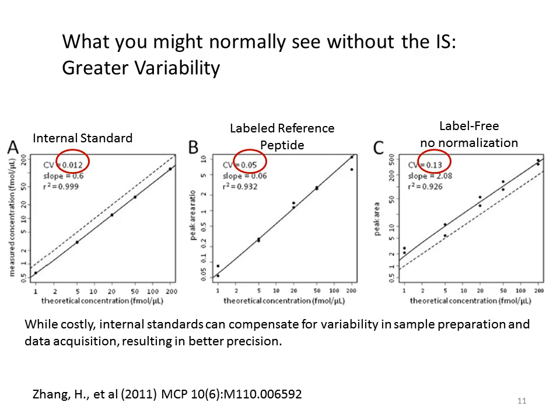In these cases, because the normalization is different, the axes on the Y are not comparable, so you can't really compare the slope. But the labeled reference peptide for that same light peptide analyte is just normalized to a different peptide eluting somewhere else in the gradient, and so its CV is calculated at 5%, but it's the same data, right?